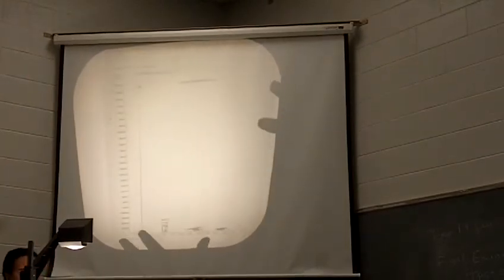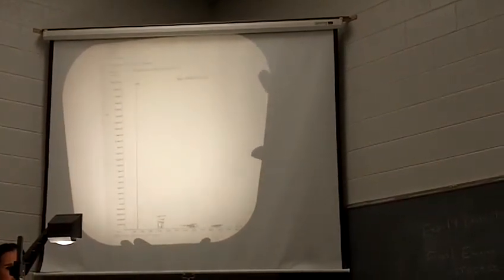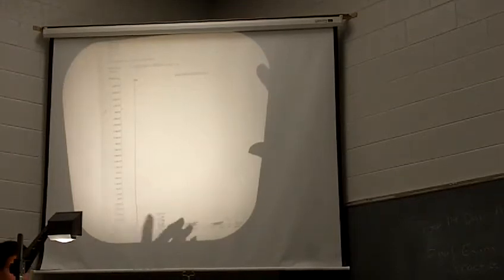So I've got an example data sheet, so if you want to see this is the chromatogram for our example. It's conditions A that we're using, okay?